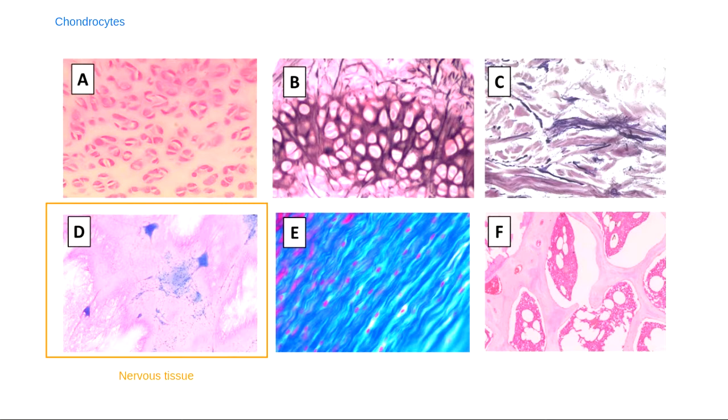So I'm going to look at these top two cartilages to start, to mention for you that these two types of cartilage, their chondrocytes look a particular way. Notice how these cartilage cells, these chondrocytes, come in groups of two. So we like to call this kind of cartilage up here, I told you guys to think about it kind of like deer tracks in the snow. So my groups of chondrocytes kind of look like a hoof print from a deer, and they're walking around, there's nothing behind them. So there's this pink stuff in the background. There's no proteins inside of it, or very small proteins, put it that way.